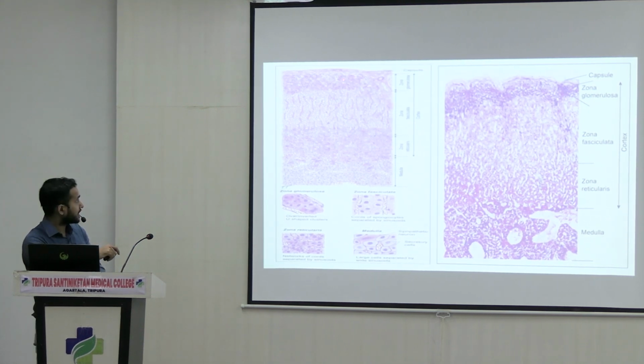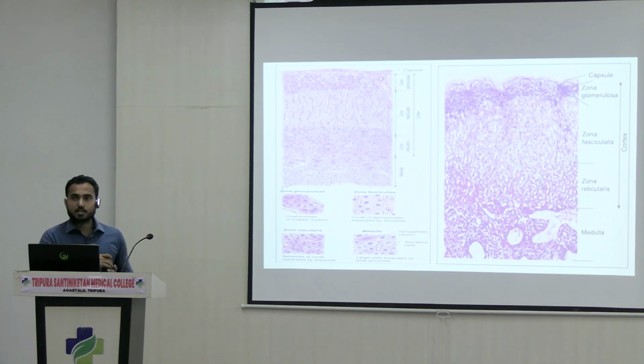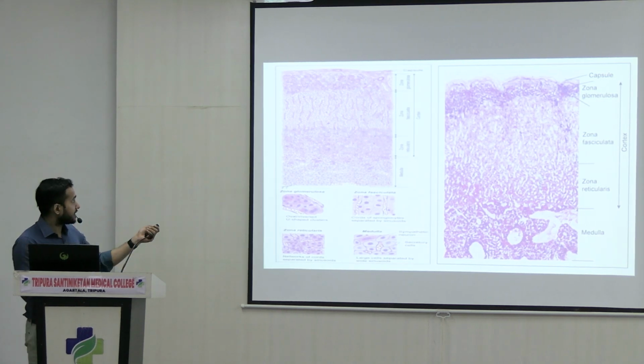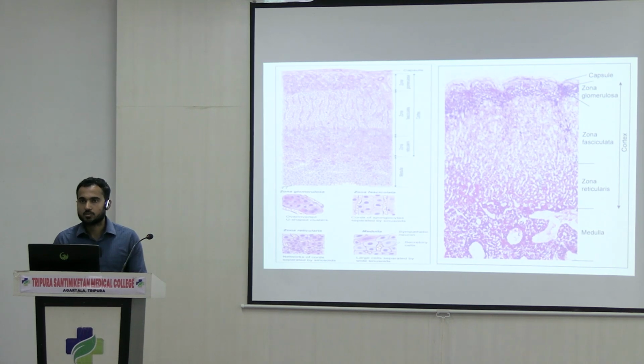Now here you can see the arrangement of the cells. To see how the cells are arranged, further high magnification is required. But I hope you can see that along with the cells, the capillaries are also present.